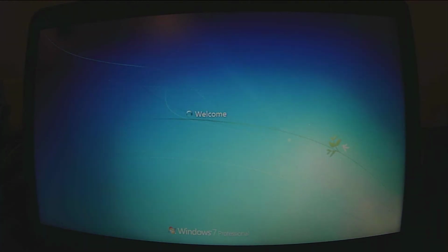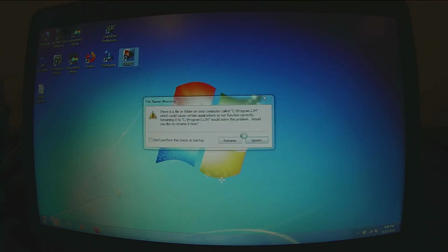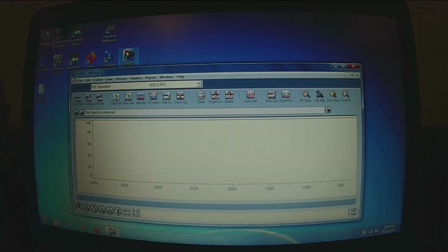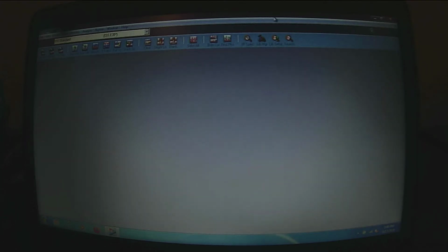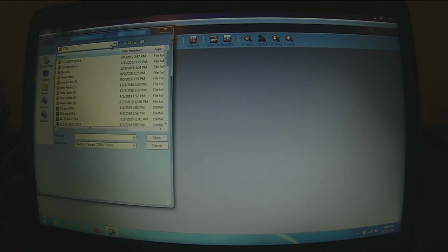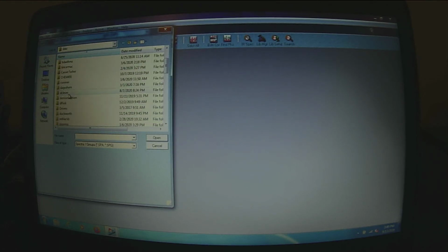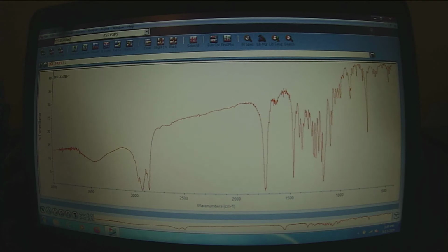We'll open up the OMNIC software, which is the same software we used to collect the spectrum, which is the Thermo Scientific software on version 9. Starting from a blank window, we'll go to menu and open our spectrum, and that was stored on the student drive in the data folder under my name in 2020 Fall Lab, the trimyristin lab, and we've got this DCL-10-42B-1 spectrum which we can open.